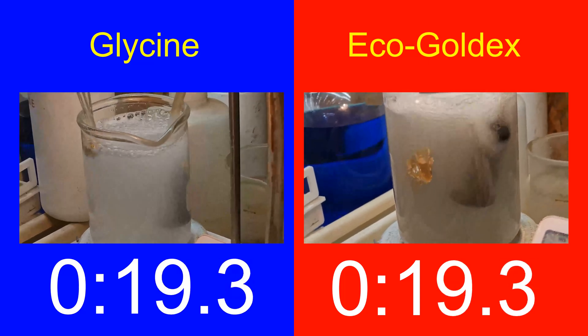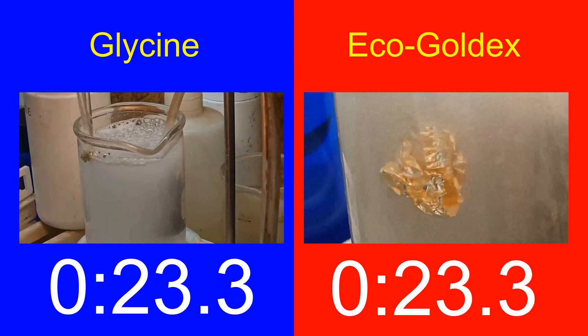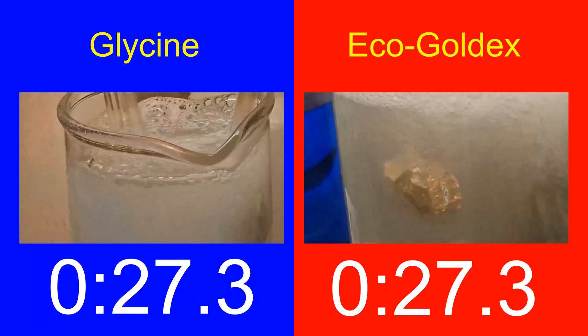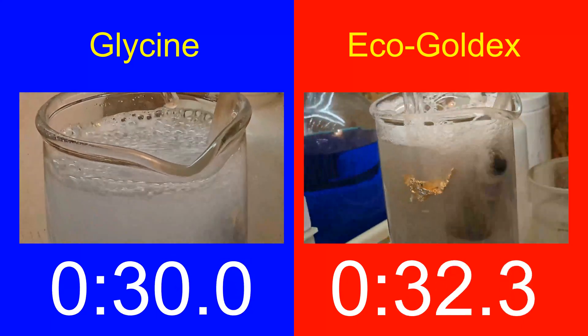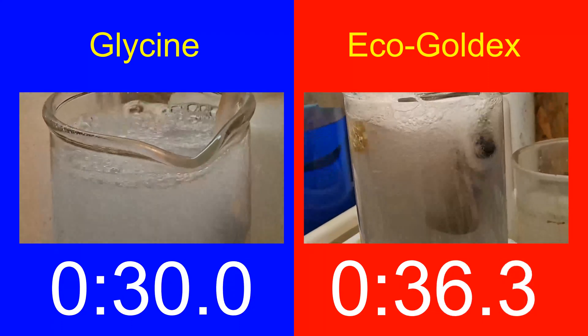From the looks of things, this won't take long. And we have a winner — it looks like 24 karat gold leaf dissolves fastest in glycine.